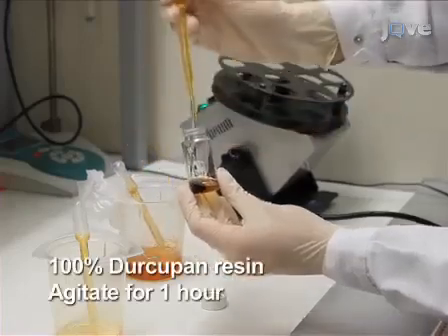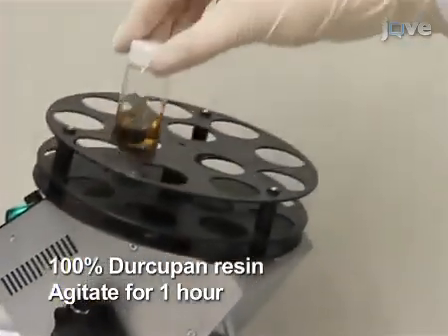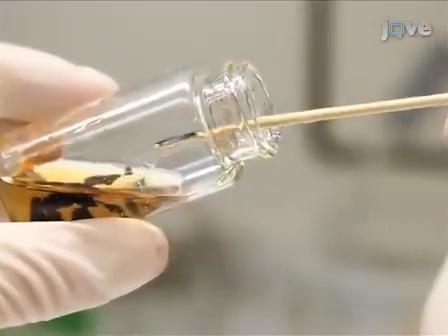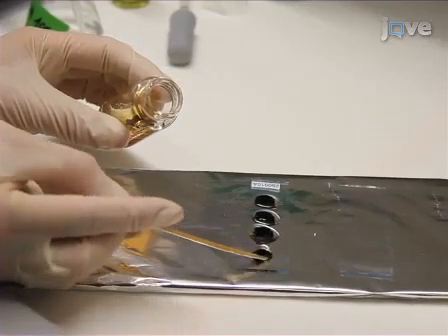Then replace the medium with 100% fresh Durcupan resin. Agitate slowly for 1 hour on the roller mixer. Following the embedding, use a wooden cocktail stick to place the sections on glass microscope slides that have been previously coated with mold separating agent.